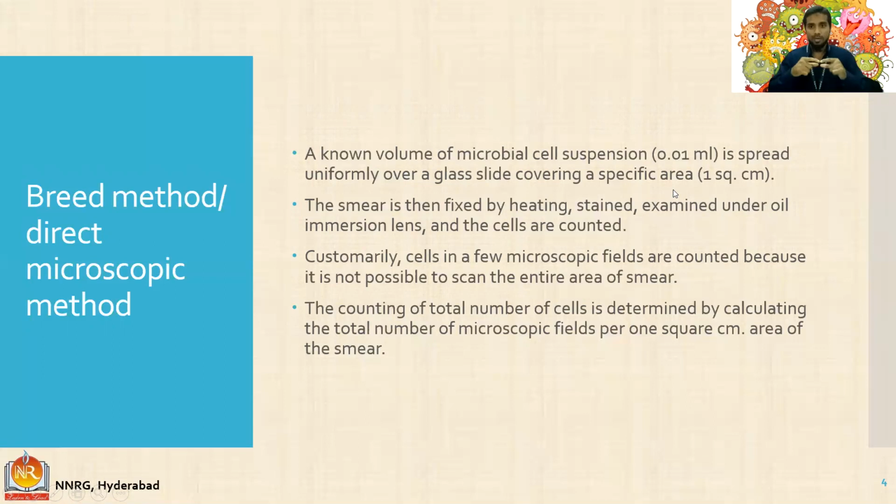So on a glass slide, just 1 square centimeter, the sample is added in a round shape. The round-shaped sample is called the smear.